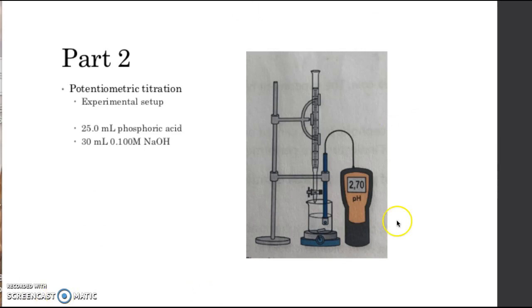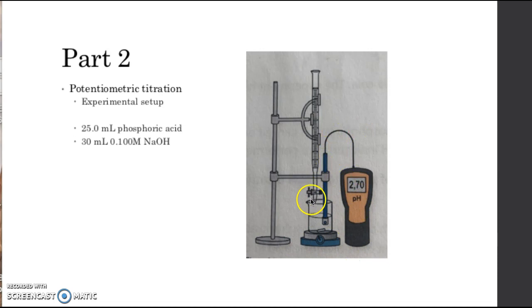In part 2 we are doing a potentiometric titration. The experimental setup is the same throughout this experiment and all these titrations. The difference in this part is that we have a pH meter. We have a beaker with 25 milliliters of phosphoric acid and a burette filled with 25 milliliters of sodium hydroxide. The pH meter is here to measure the pH value throughout the titration to see when it rises and what happens.